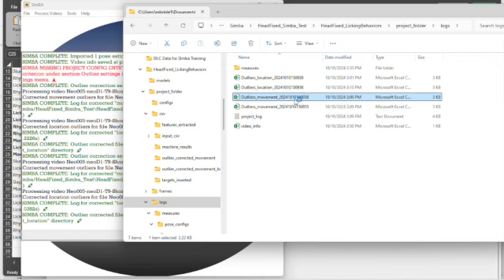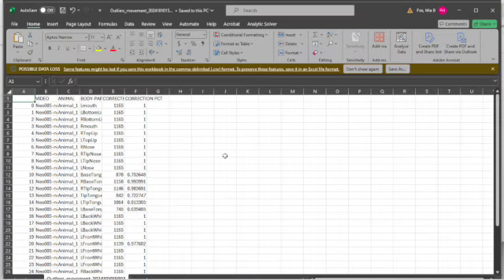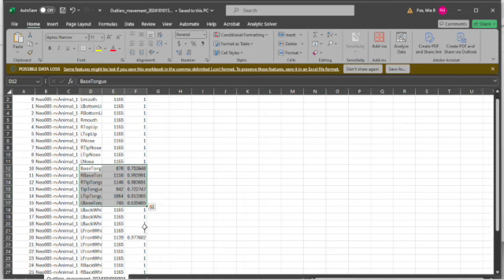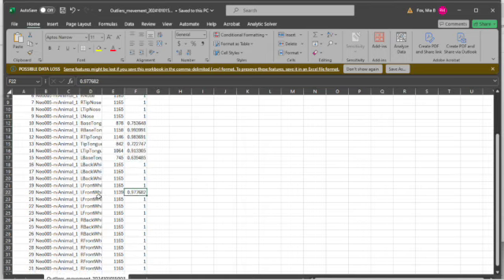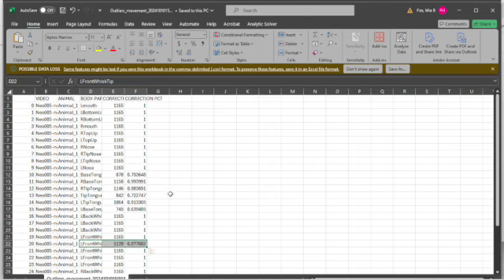This shows essentially how many times it adjusted. It's saying that 100% of my frames were correct for some body parts, whereas the base tongue and the tip tongue, which aren't present in every frame, had some more adjustments, and there were some adjustments to the left front whisker tip. But generally, it didn't make a ton of adjustments to the points that DeepLabCut had put out.